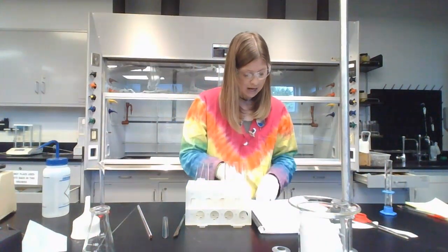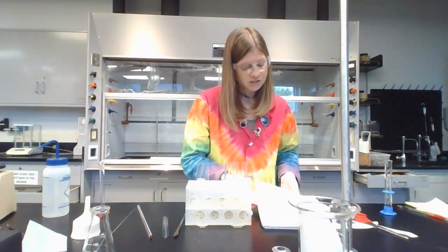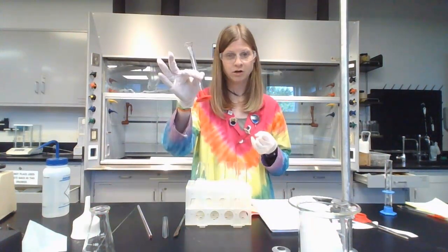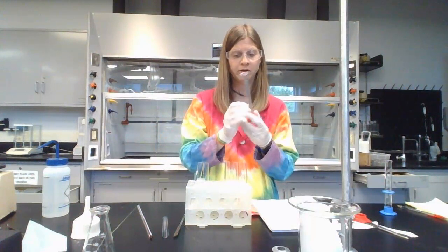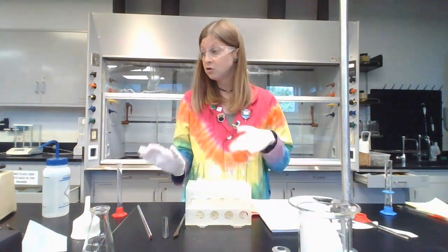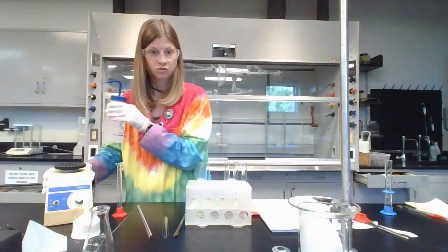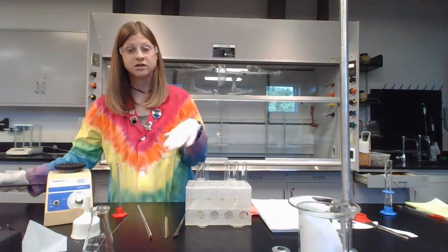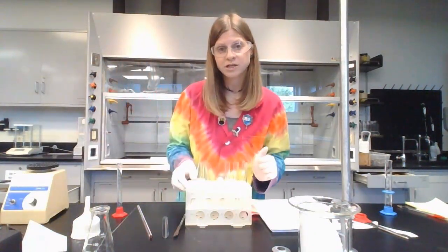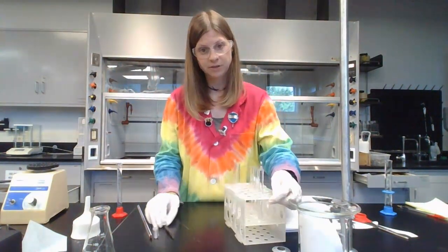So what we need to do now is to add 2 milliliters of methanol to each of them. So using a small graduated cylinder, you're going to measure out 2 milliliters of methanol, pour it, pour it, pour it. Then we want to mix it or vortex it. So our vortexer is over here, until all 3 solids completely dissolve. So they need to be completely gone. Those are the 3 chemicals that we're testing for our thin layer chromatography.